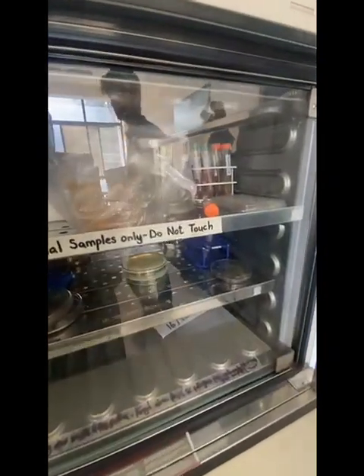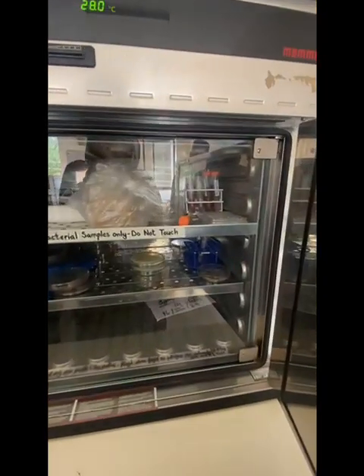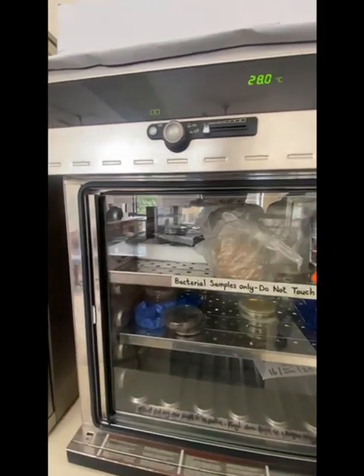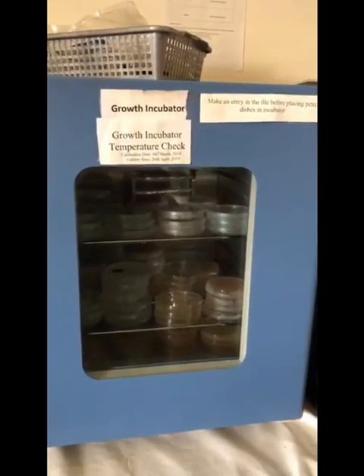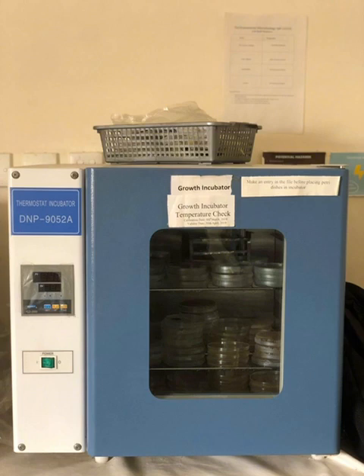Growth incubators are typically designed to be compact with airtight chambers made of corrosion-resistant materials such as stainless steel. They often feature shelves or racks for easy placement of culture vessels and adjustable airflow systems to ensure uniform distribution of temperature. Regular maintenance, calibration, and validation are essential to ensure the accuracy and reliability of growth incubators' performance. Manufacturers often provide guidelines and services for proper maintenance and calibration of their incubator models.